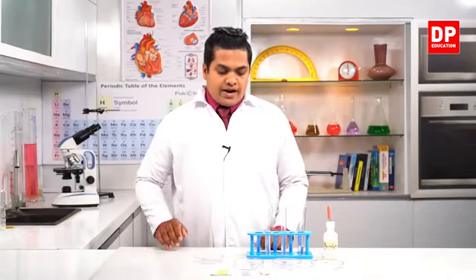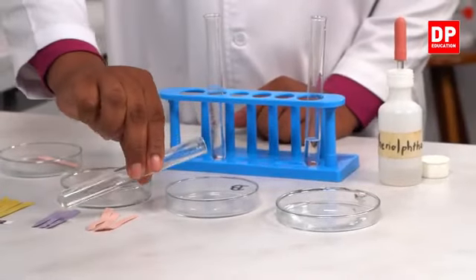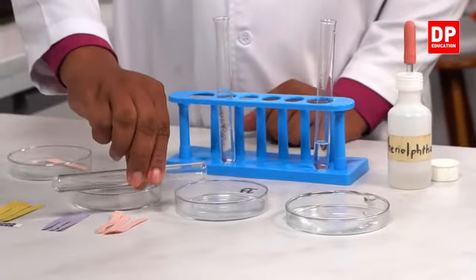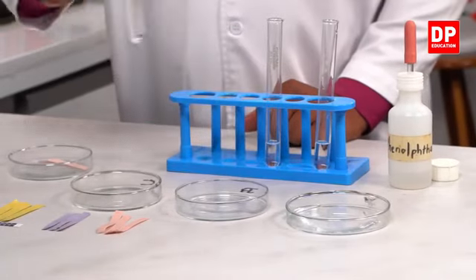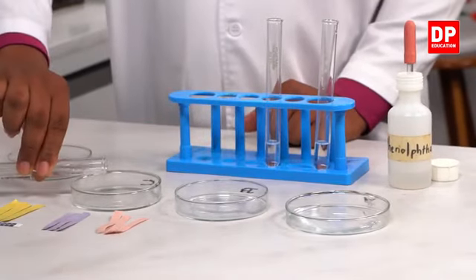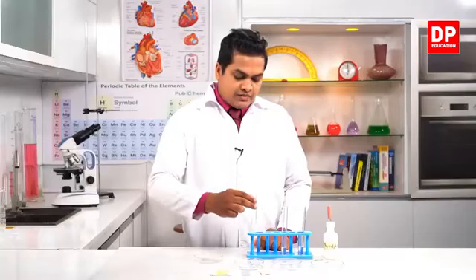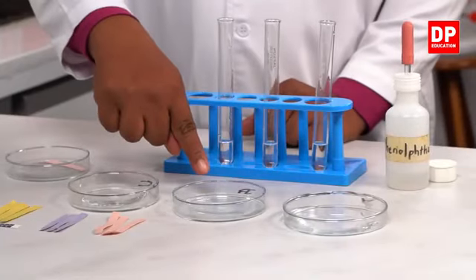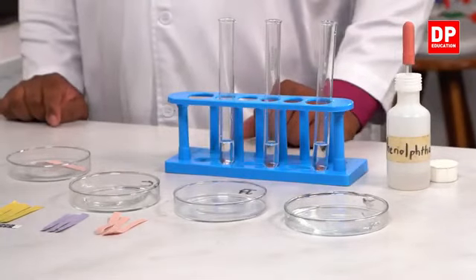Then I am going to add B solution to the B Petri dish and C solution to C Petri dish. Once again, A contains hydrochloric acid, B sodium hydroxide solution, C sodium chloride or common salt solution.